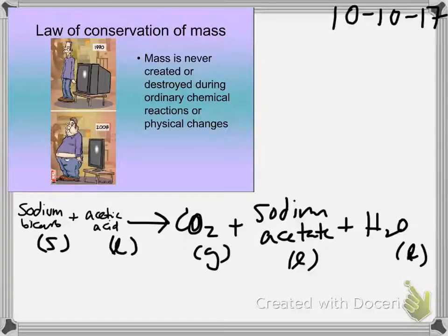That CO2 gas, however, and this is what makes it such an appealing reaction for 5-year-olds, makes bubbles. Anytime we create an insoluble gas, we get bubbles. That's one of the ways we know a reaction has occurred. So, in the open bag, where does that gaseous CO2 go? Out. It's just lost to the atmosphere. It's gone. So what we know is in that open bag, we would expect to see a reduction in mass because we lose this gaseous product.